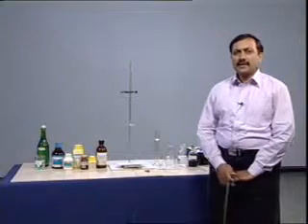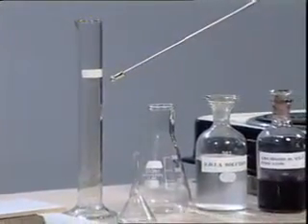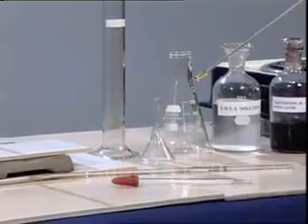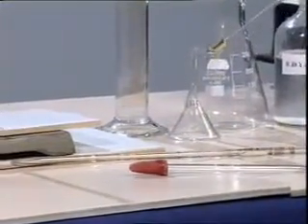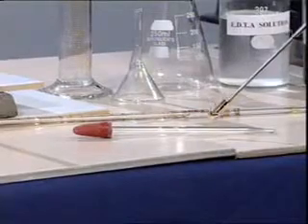We need simple glasswares like burette of 25 or 50 ml capacity with a burette stand, a measuring cylinder of 100 ml capacity, conical flask of 250 ml capacity, glass funnel, a pipette of 1 ml capacity and a dropper.